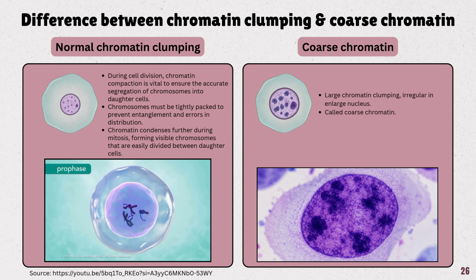So now let's take a good look at hyperchromatic versus hypochromatic. What causes hyperchromatic and hypochromatic color of the nucleus under the microscope? For hyperchromatic, first, abnormal DNA content. During malignant transformation, the normal cell cycle checkpoints, like the G1/S checkpoint, fail completely. This causes the cell to undergo uncontrolled, rapid replication cycles without dividing its cytoplasm, leading to severe chromosomal abnormalities, gaining extra copies of chromosomes.